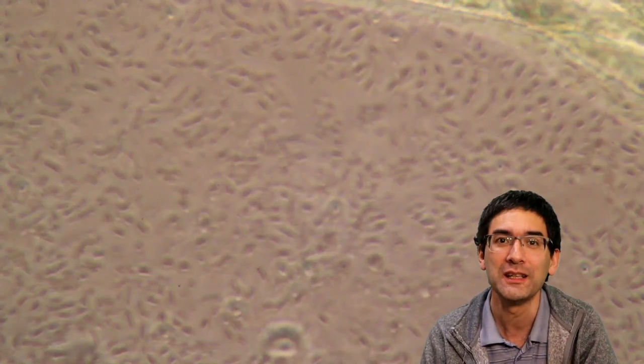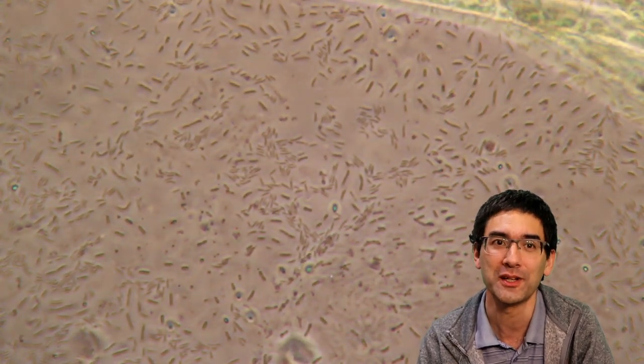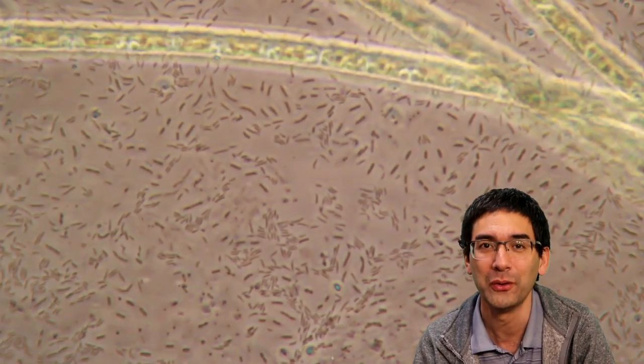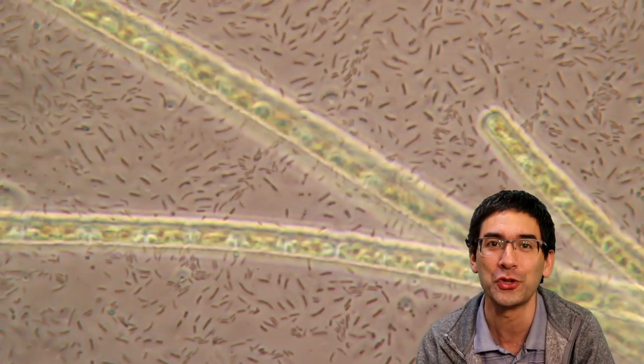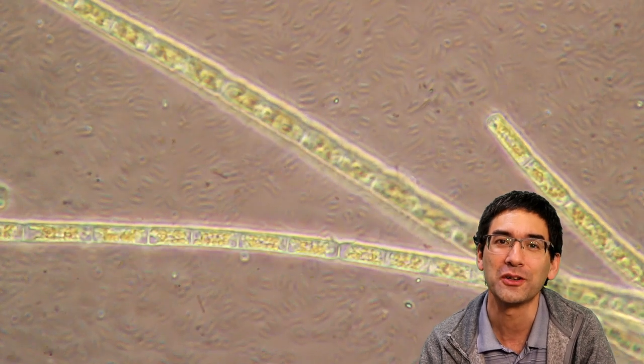Then I filtered it and again added some algae. This is basically what I saw: lots of bacteria, because of course they also grow and feed on the nutrients, and also algae like these green filamentous structures that you see here.